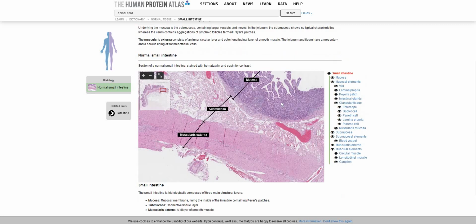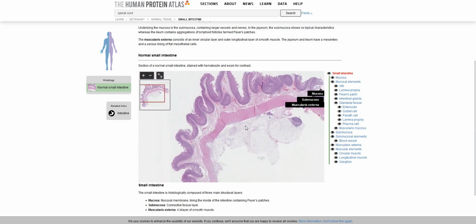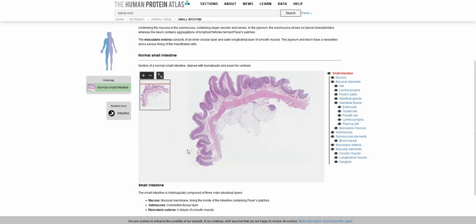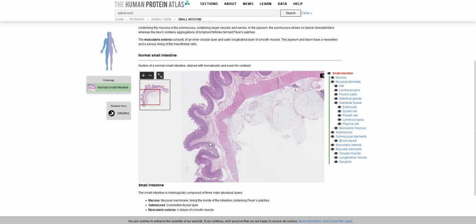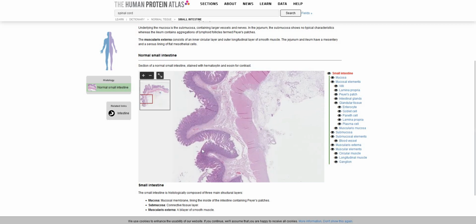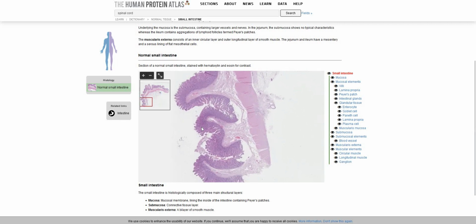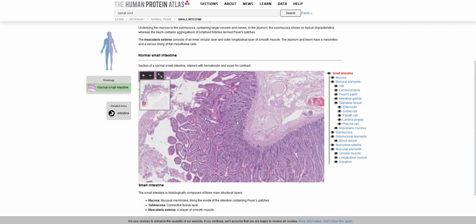Let's move on to the jejunum now. Jejunum and ileum are going to be found on this same slide. How the slide works is towards the left we have our jejunum, and it is eventually going to transition into our ileum. So this is a great way to practice identifying the regions, because we don't have them nicely separated for us. The jejunum is our middle portion of the small intestine, and it's really generic. There are no special features within the jejunum that help us identify it, so we need to use process of elimination to figure out what it is.